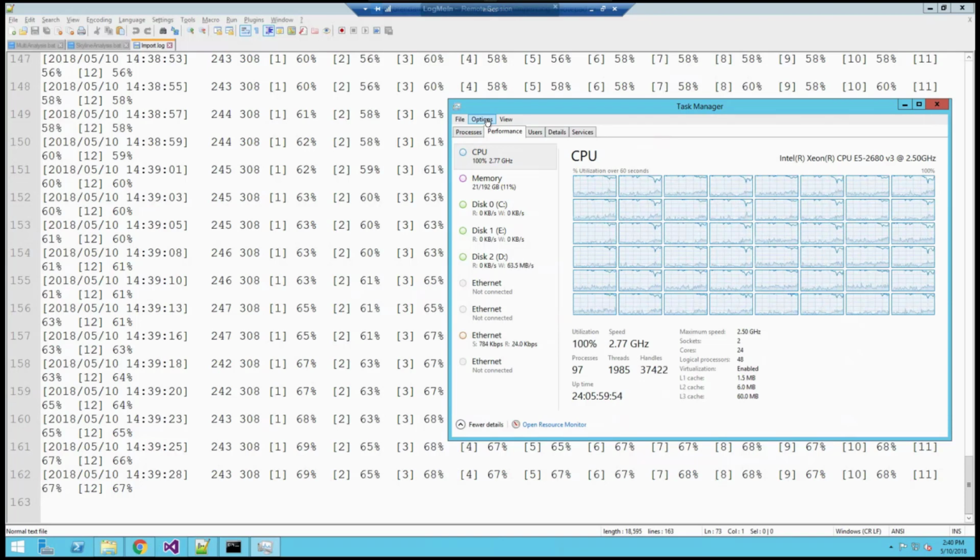No, this one's like tens of thousands. It's like $12,000. It's a server, and I actually got the idea by going to MaxQuant. MaxQuant has a recommendation of what you should buy to really run MaxQuant, and it's something like this. It's a Dell Edge, and the Aebersold Lab has one of these too. So I just started thinking, if you had one of these, and we didn't have one at the time, I want to make sure that Skyline can use all of it. And I think we've done that. You can do quite a lot of processing.